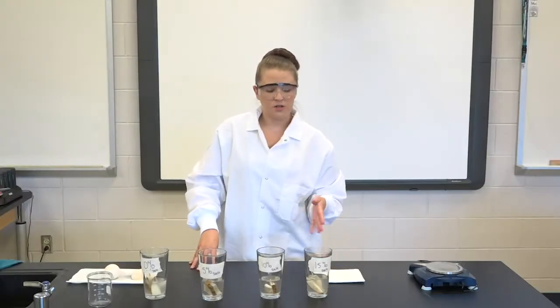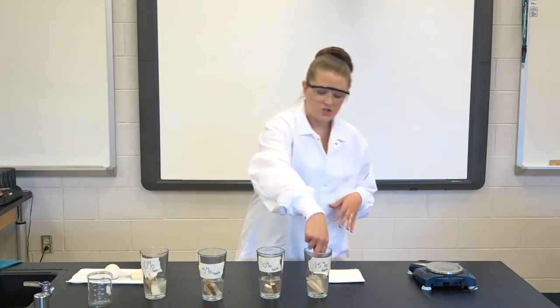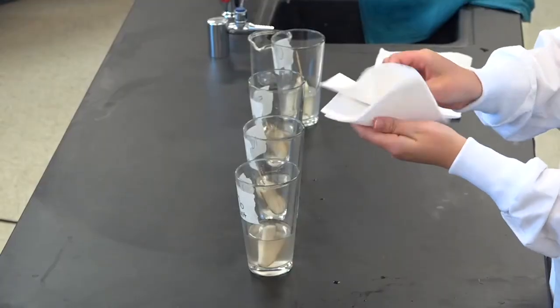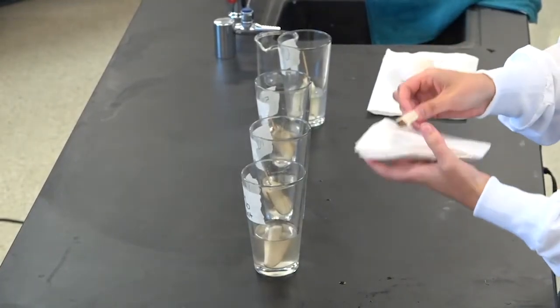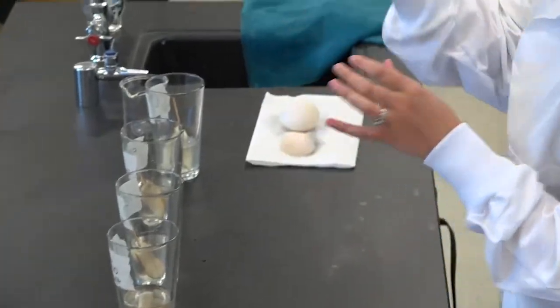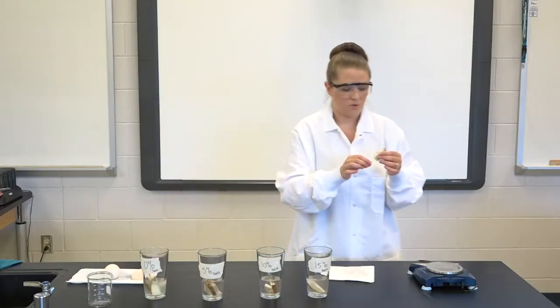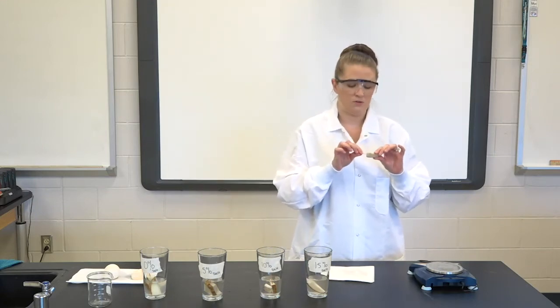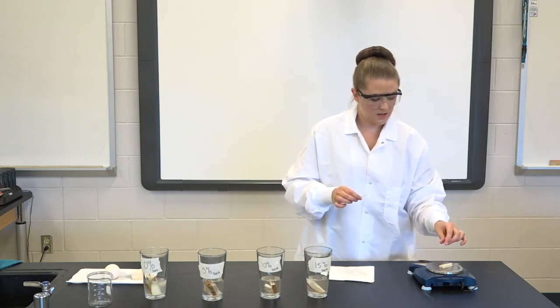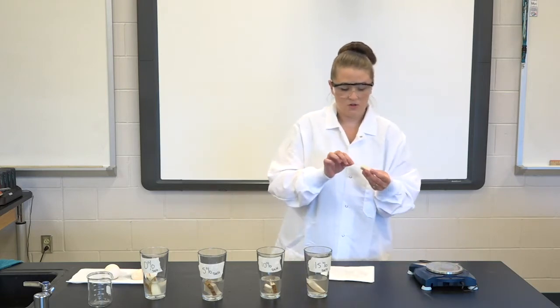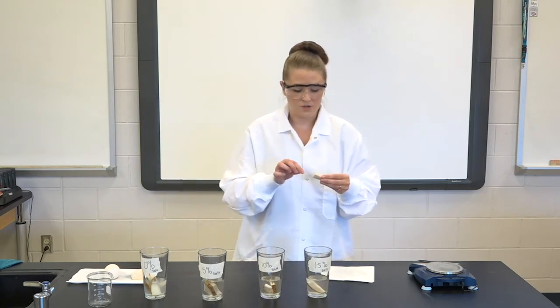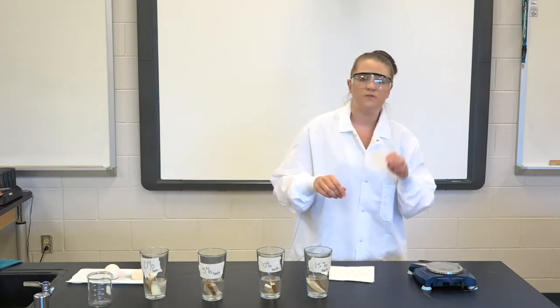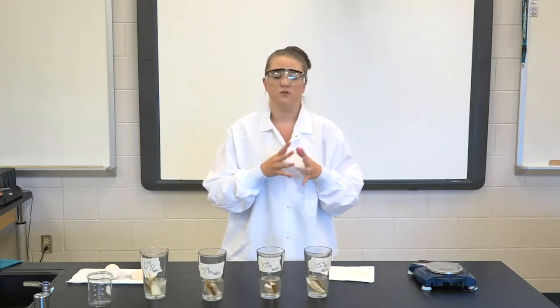Welcome back! We're going to see what our results are. Take out each slice and make sure that you dry it off, as extra water on the slice can mess up your results. I did mark it with the toothpick so I know this is strip one. You're going to weigh each strip for a final mass and record it. I'm going to record that the one in the 15% salt solution has lost mass — it has gone down to 5.7 grams from an original 8.5.